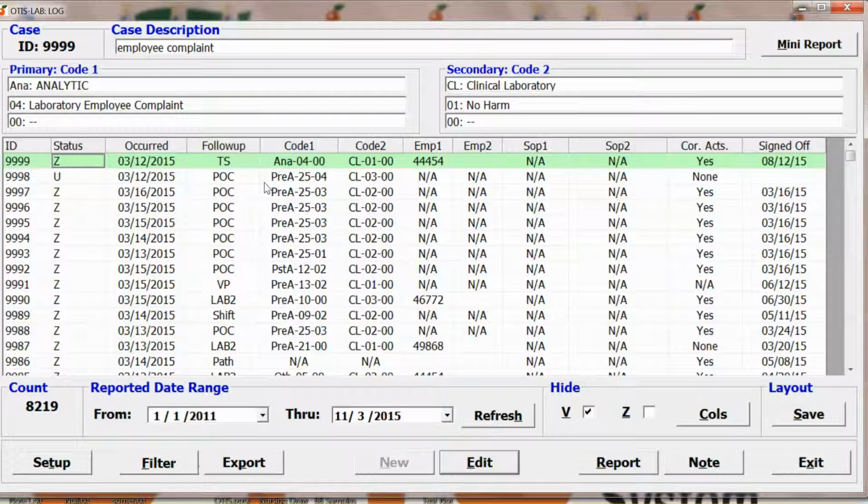There are some other data extraction capabilities which I will mention but not demonstrate. The filter feature that we just looked at provides for specifying logical OR conditions as well as logical AND conditions. That is, we can do ORs and ANDs without actually typing the word OR or AND.